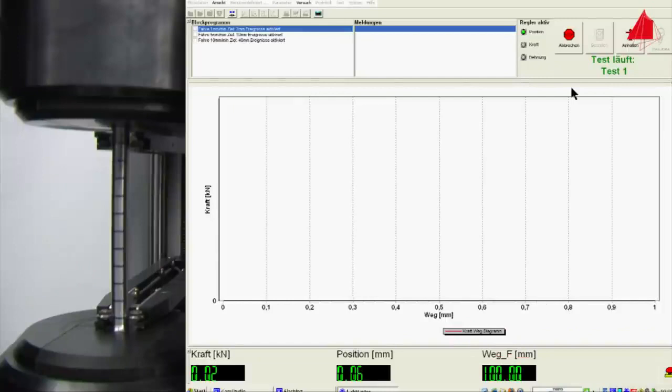During the tensile test, the test piece is slowly and constantly elongated with a standardized speed. The force that the test piece opposes to the imposed elongation is recorded and can be seen at the bottom left-hand corner of the computer display. The material behavior can best be observed in a force elongation diagram. The force F is being plotted upwards on the vertical axis, the elongation delta L towards the right on the horizontal axis. At first, the force rises rapidly.